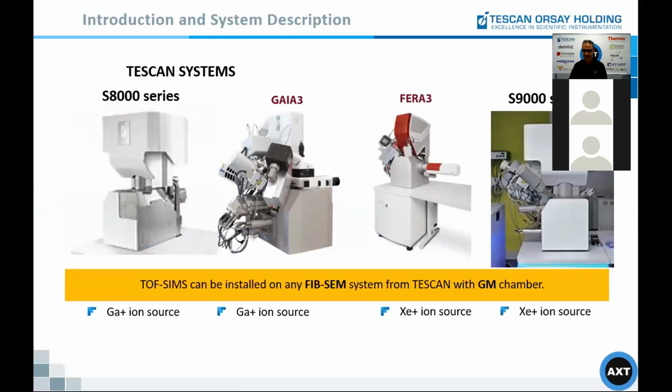William had his ToF-SIMS detector on a gallium FIB, as he mentioned a few times during the presentation. At the moment, you can have that on plasma FIBs too. And very soon we will have one of these ToF-SIMS detectors on a plasma FIB at ANSTO. So maybe early next year, you can get in touch with ANSTO Microscopy, Joel Davis and his colleagues, to see that system and whether you could get access to it.